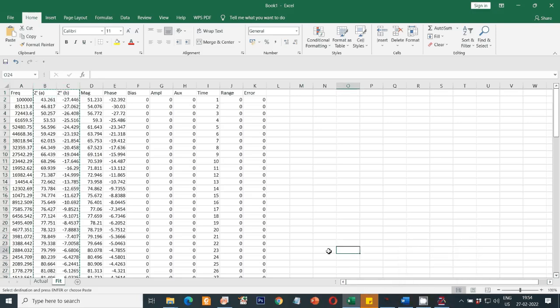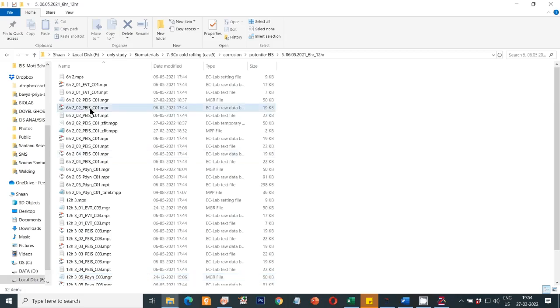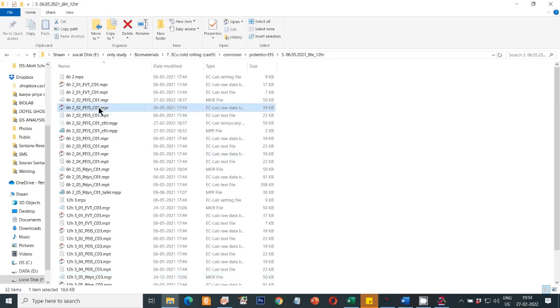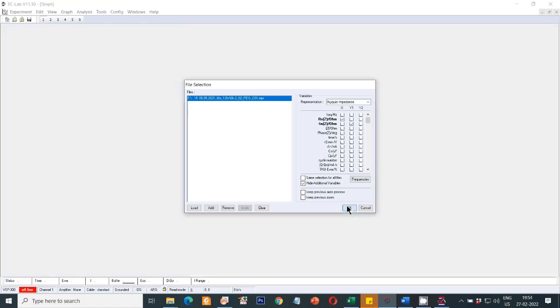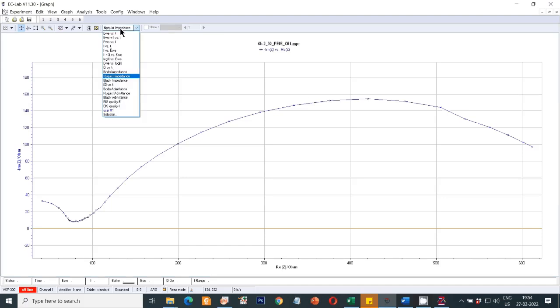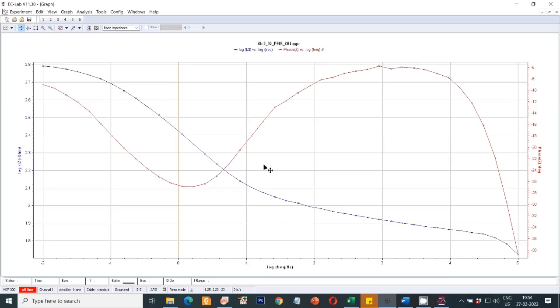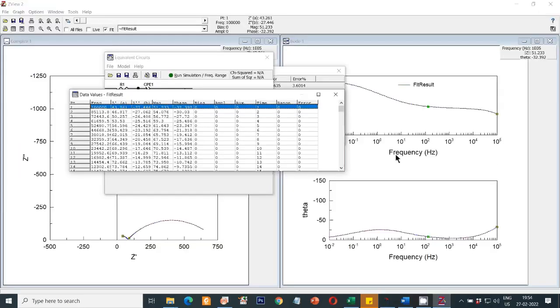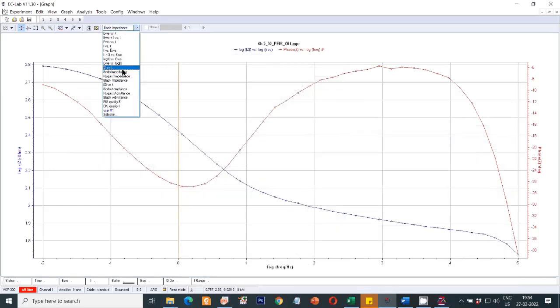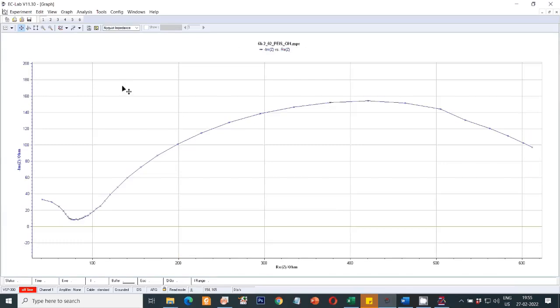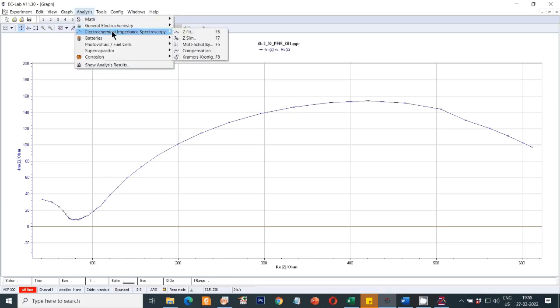Now let's go to the EC Lab software. These files were already fitted in ZVUE software. Double-click to open directly in EC Lab and click OK. You can see the Nyquist plot; to switch to Bode plots, select the Bode Impedance option — these are the Bode impedance and Bode phase plots. The difference from ZVUE is that in EC Lab you have to view each plot in separate windows.